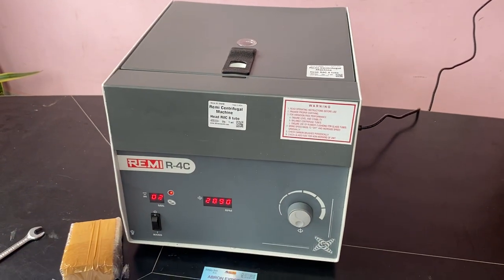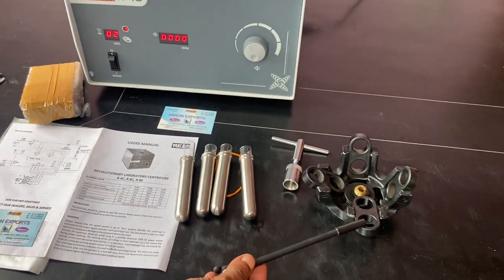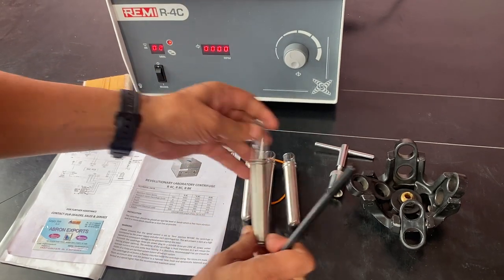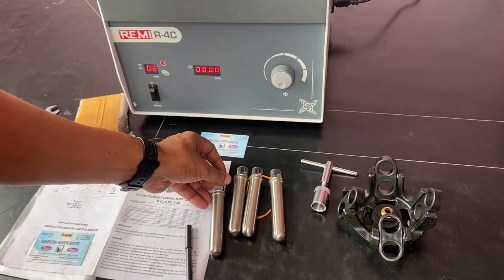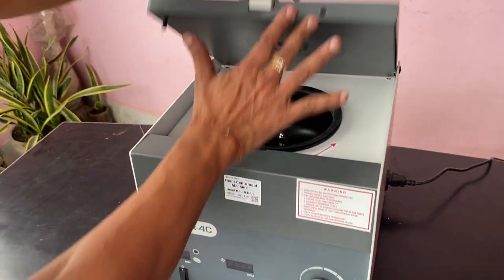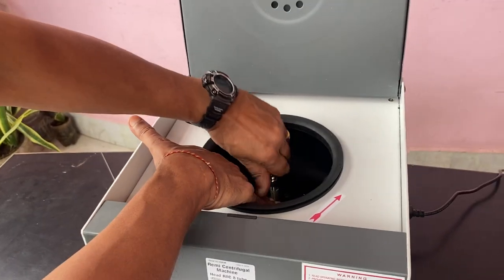I have to make it zero first. The head is an R8C head with 15 ml tubes. To attach it, let me show you — switch off. It comes off once only.